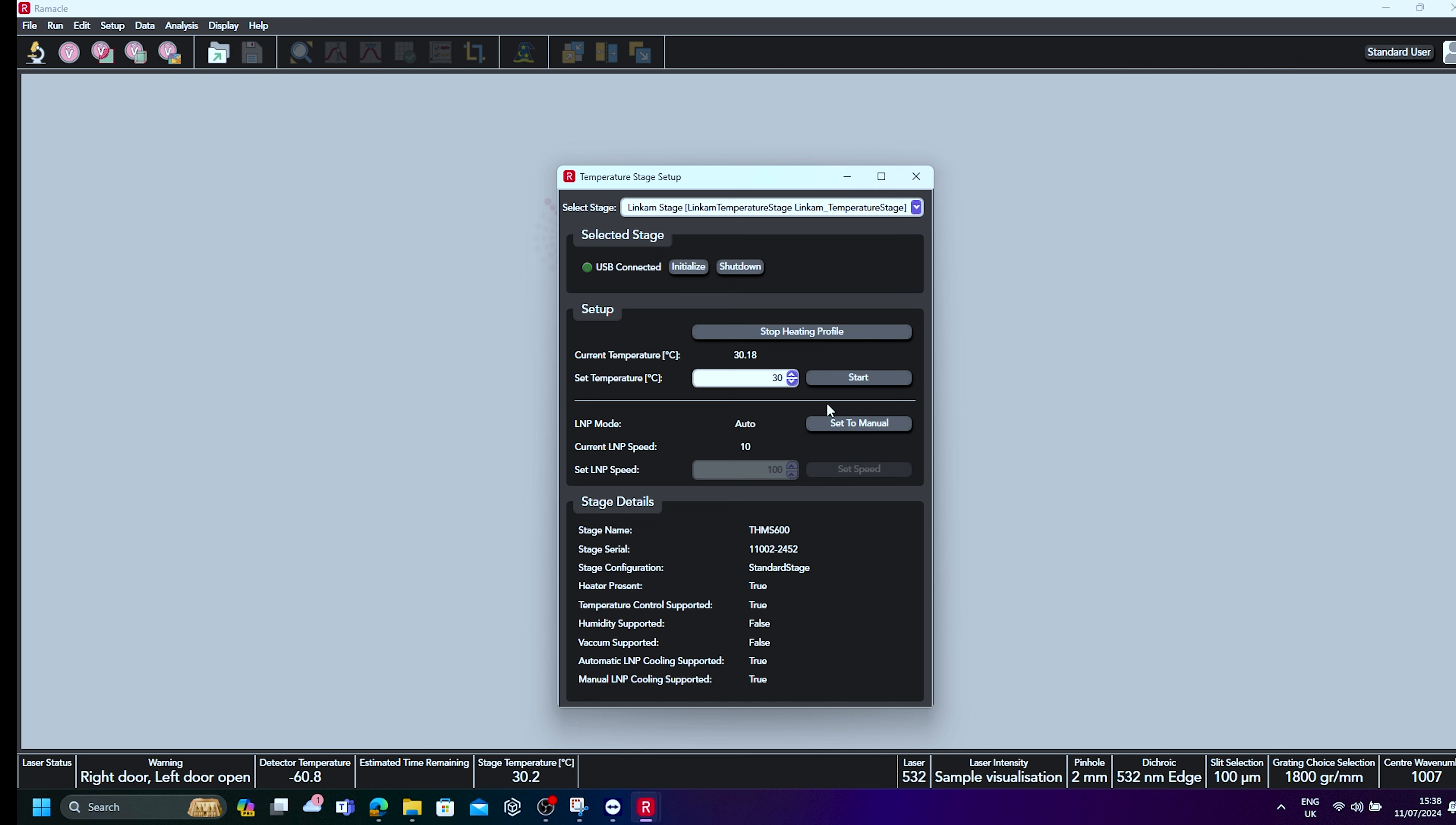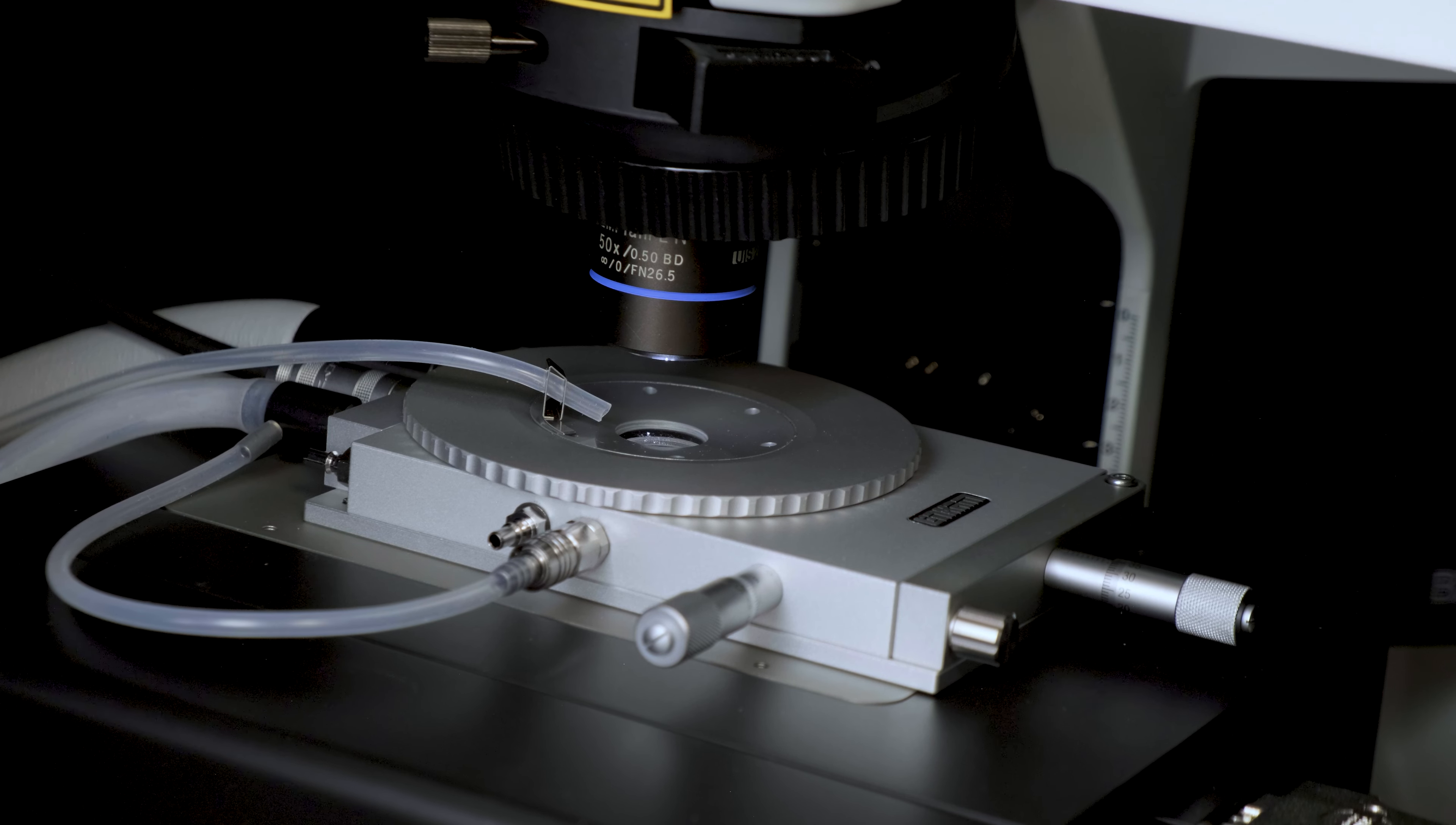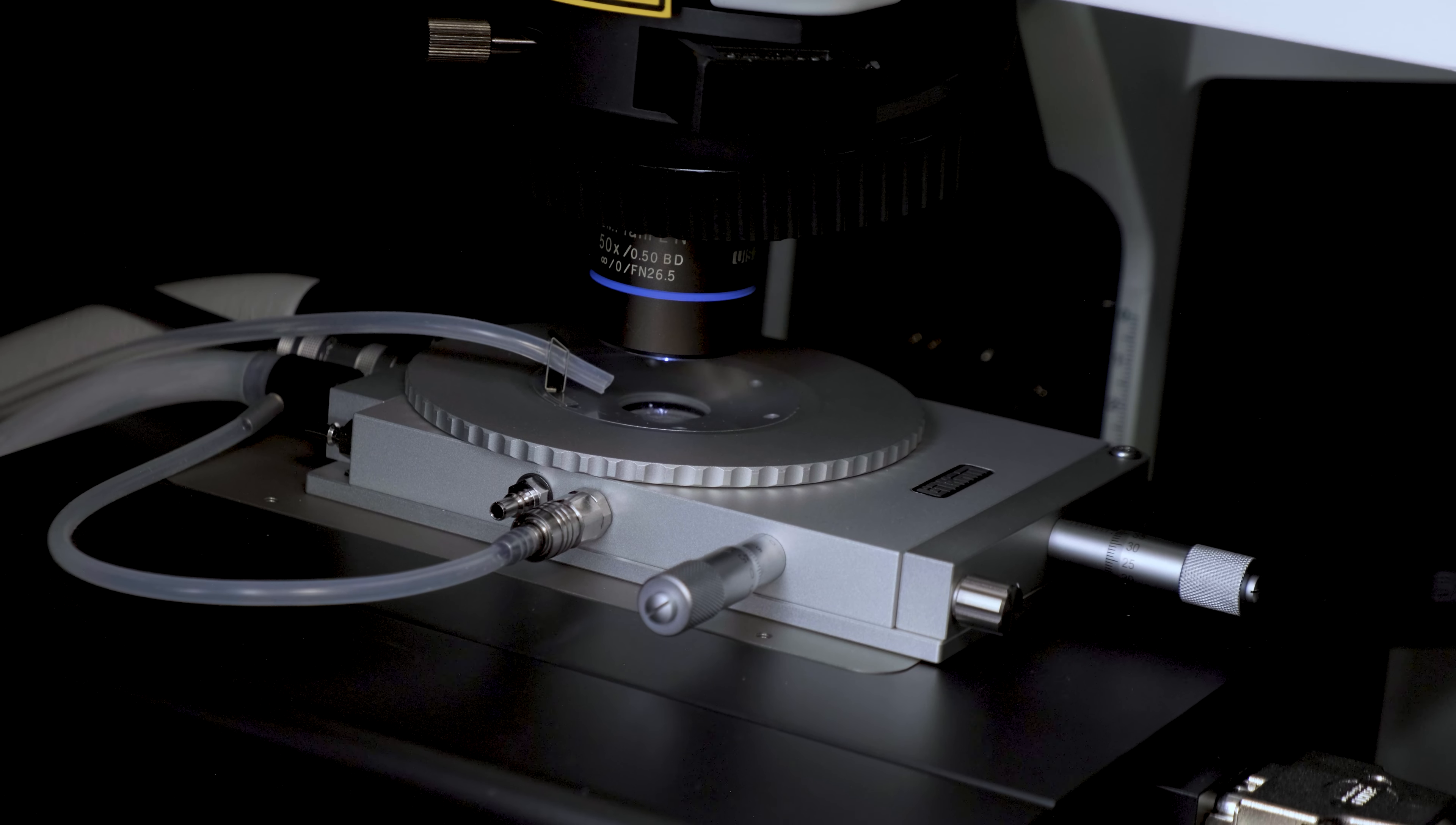The temperature can also be changed to the starting temperature for your measurement. Now, focus the sample under the microscope. A high magnification, long working distance objective is best to focus through the window of the temperature stage and detect strong Raman scattering intensity. Here we are using a long working distance 50 times objective with a numerical aperture of 0.5.